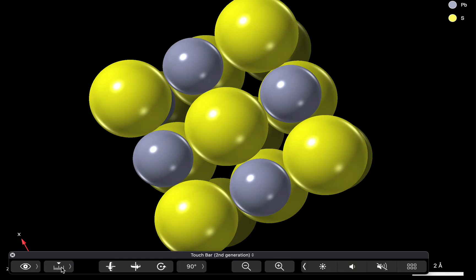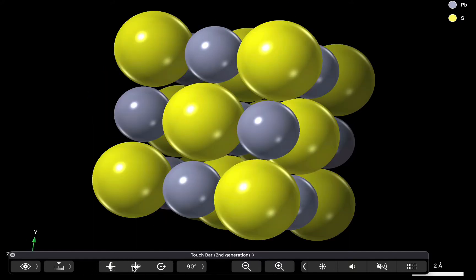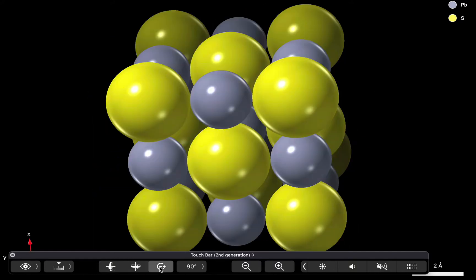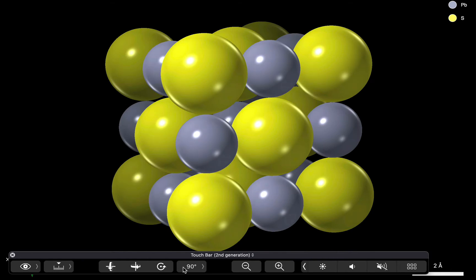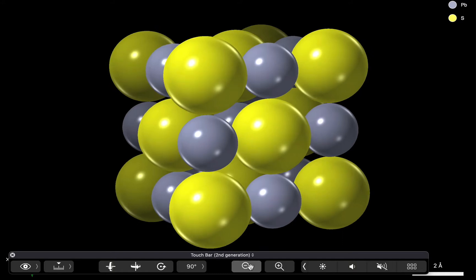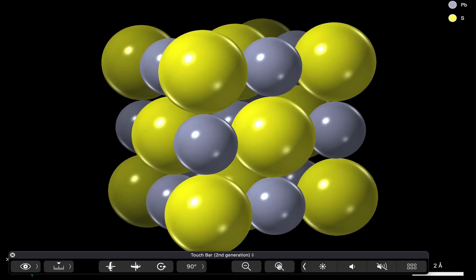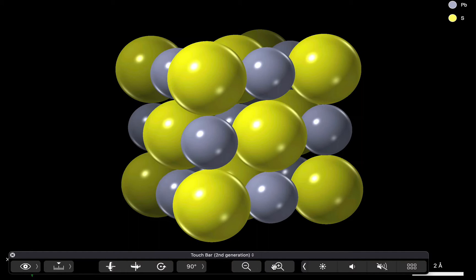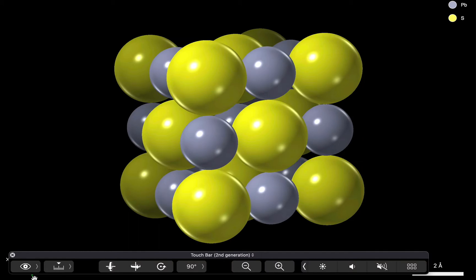Now to hide the rotation dials, you can click the little cancel button. Mac users with a Touch Bar also get some other rotation controls, so we can rotate through 90 degrees using these little buttons. You can change the rotation angle using this rotation angle pop-up. You've got your pair of zoom buttons, and there's also a view direction command. OK, let's hide the Touch Bar for the moment.